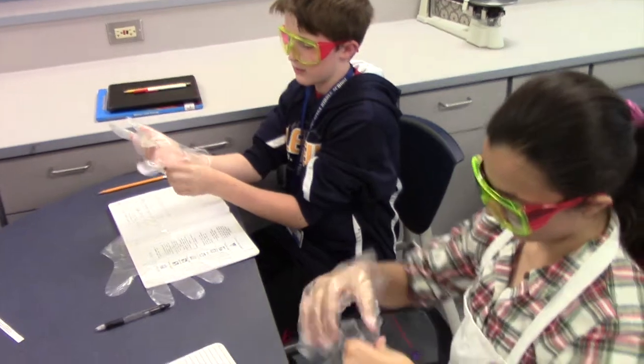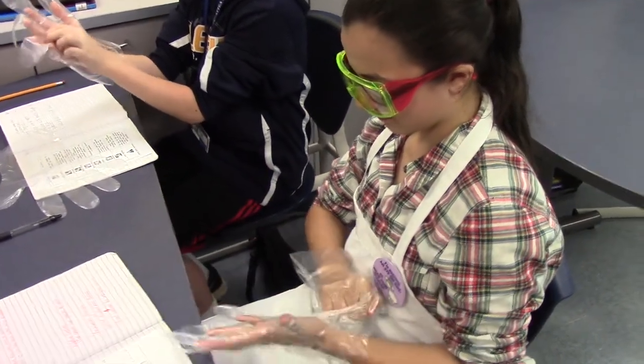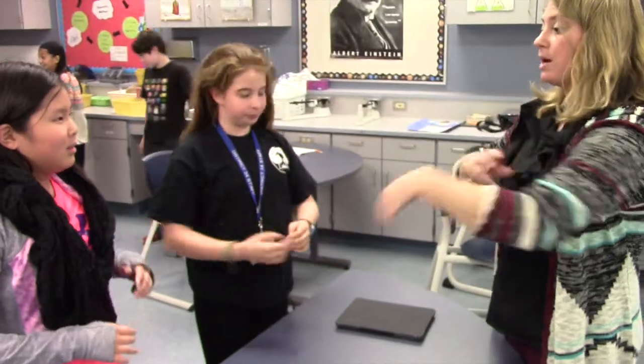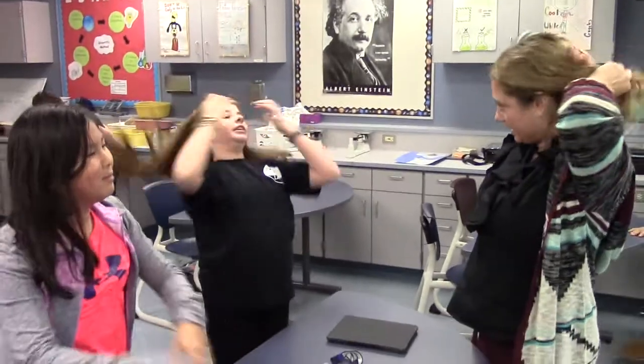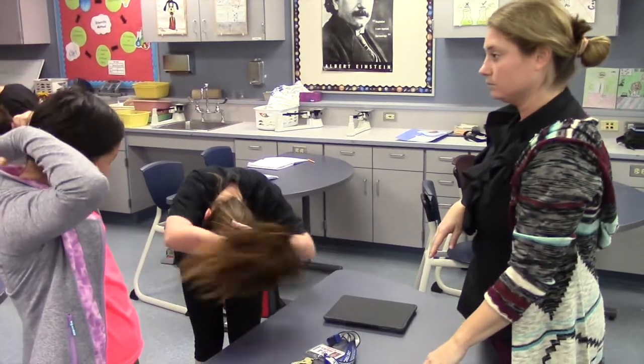Use gloves, heat or cold-resistant mitts, or other hand protection when working with hot materials, dry ice, noxious plants, liquids, or live animals. Students need to tie back long hair and secure loose clothing and dangling jewelry, especially when working with chemicals or heat sources. Remind students to keep science materials away from their mouths, noses, or eyes when conducting or cleaning after an activity or experiment.